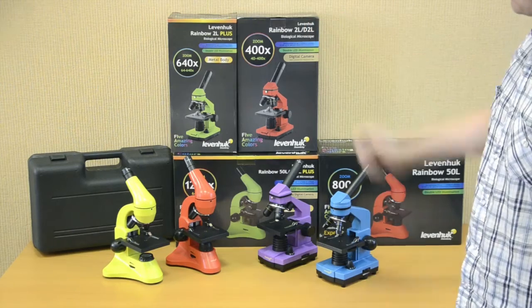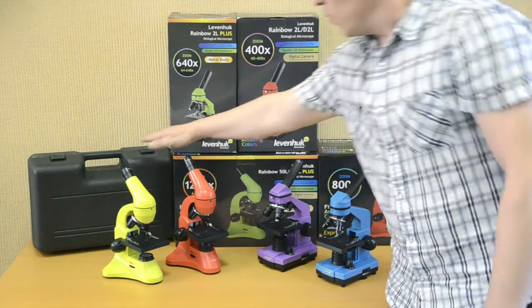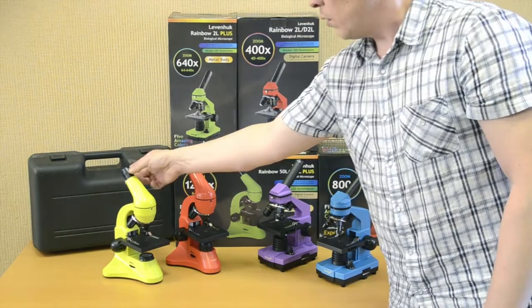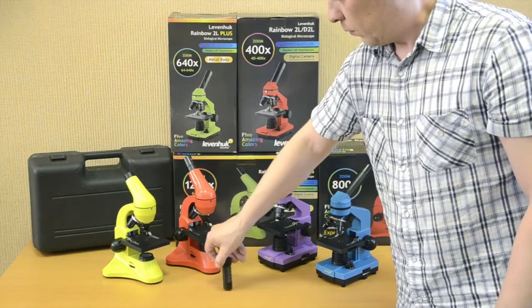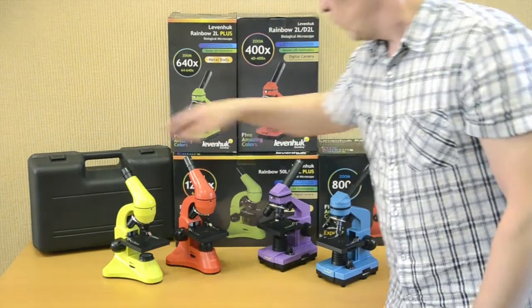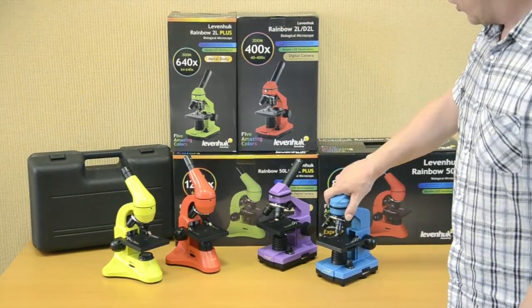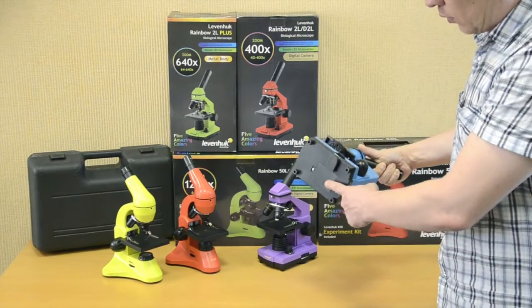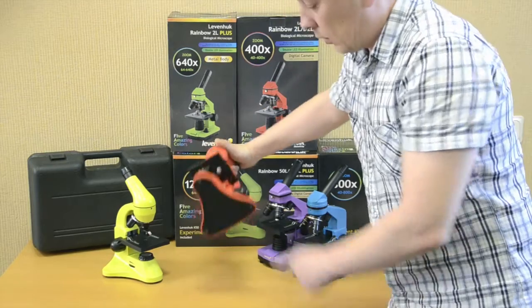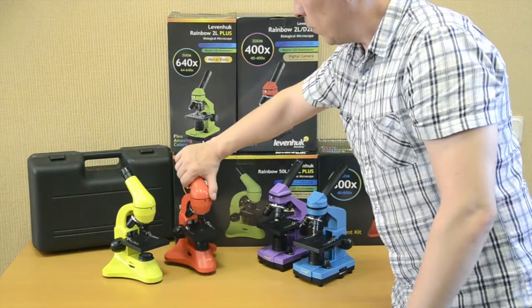The Rainbow 50L and 50L Plus also come with a plastic case and a Barlow lens in the kit. All Rainbow microscopes can be powered by an electrical outlet or by batteries. The kit includes 3 batteries for Rainbow 2L or 2L Plus microscopes, and 2 batteries for Rainbow 50L or 50L Plus models.